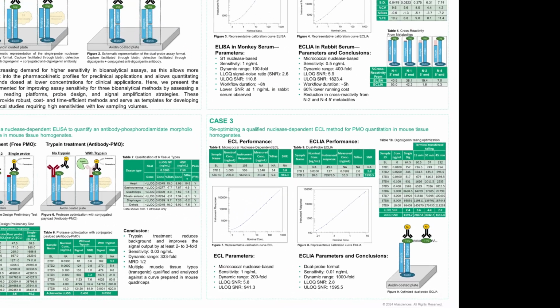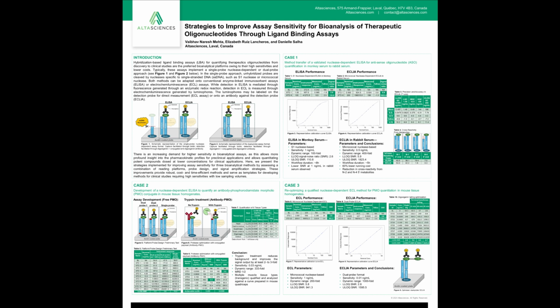In conclusion, these cases highlight some of the strategies through which quantitation of therapeutic oligonucleotides by conventional ligand binding assays can further be improved. These improvements not only provide methods with higher sensitivities, but also prove to be robust, cost-effective, and time-efficient.